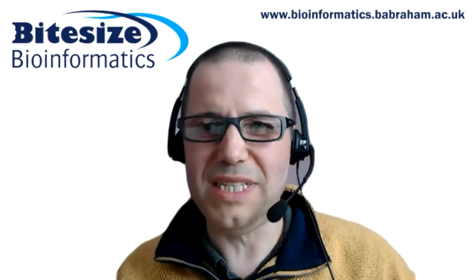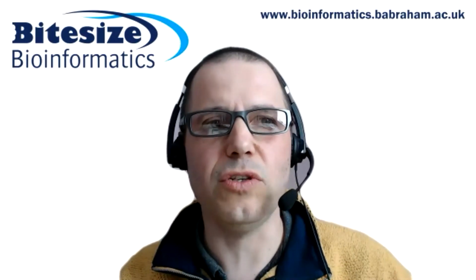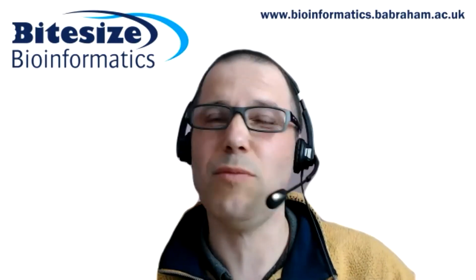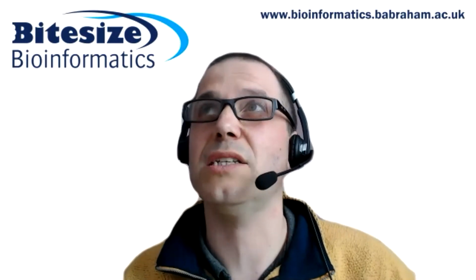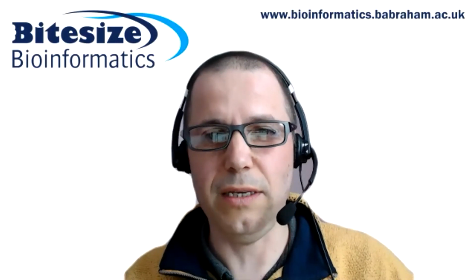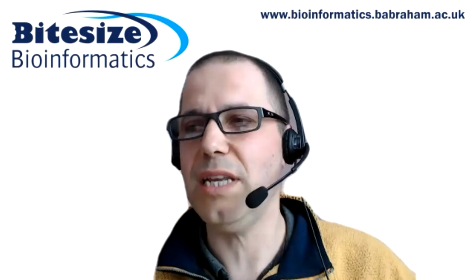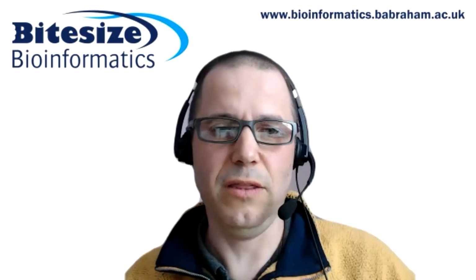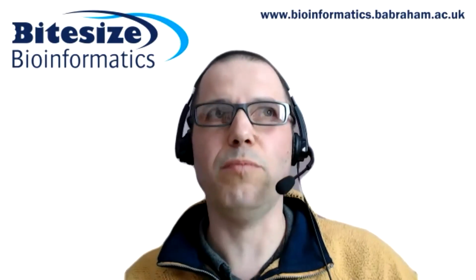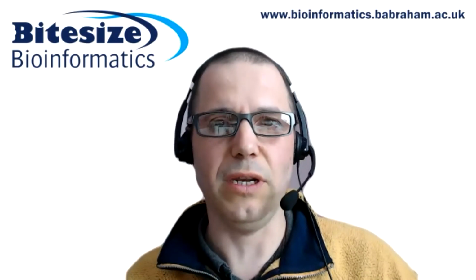Today we're going to look at one particular aspect of this, which is the use of Vistories. Vistories are something that have appeared in SeqMonk relatively recently, probably within the last year. They actually came about from a project at the Cambridge area bioinformatics hackathon. They're an interesting way to combine the flexibility of a graphical program like SeqMonk with the more rigorous recording and reproducibility that you would get from using something like R.